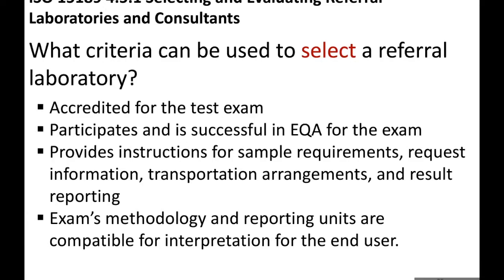So what are they using? What methodology are they using? Then have they validated and verified it? Look for information on that. Ask to see reports of their validation and verification of any equipment they are using for the exam. We need to make sure that when we're selecting a referral laboratory to send our samples to, we apply these criteria. And we may not apply everything. We have to look at what is relevant within our scenarios.